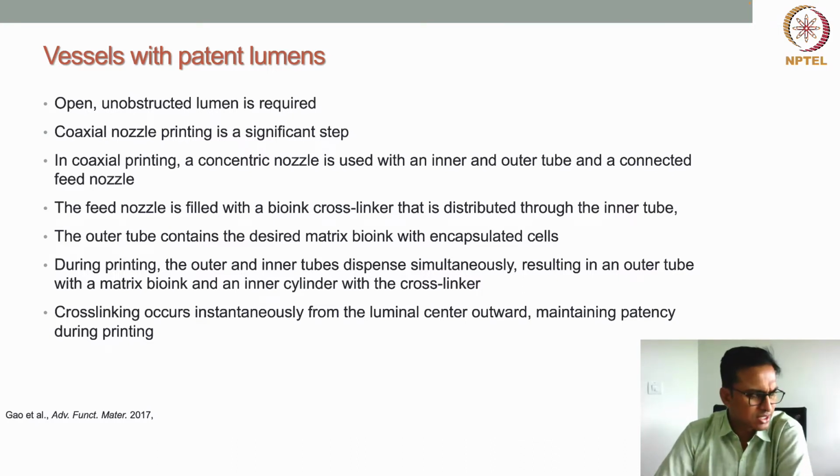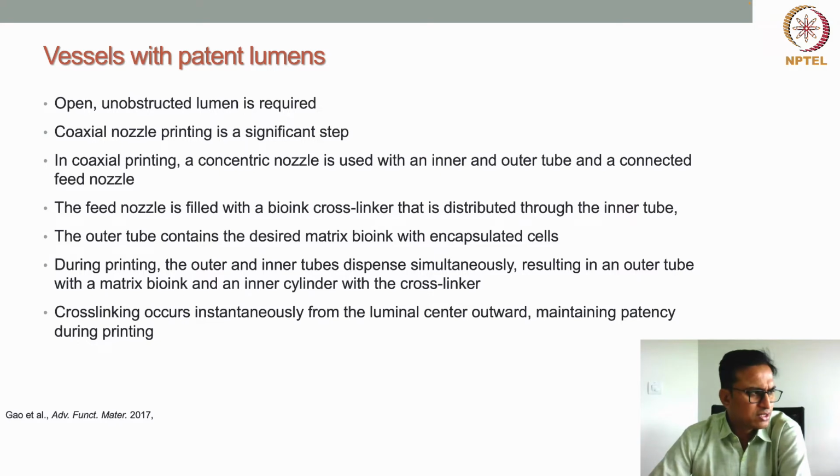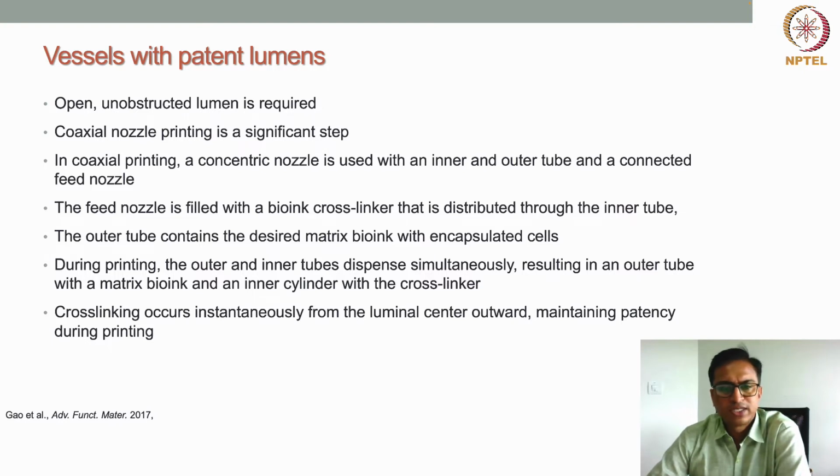First, we'll discuss how to generate blood vessels with patent lumens. That means how to generate an open, unobstructed lumen by bioprinting technique. There are a few techniques by which people are trying to do that, but coaxial bioprinting is a significant step in that direction.